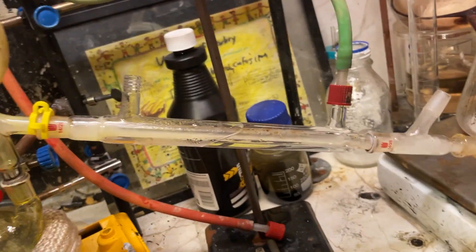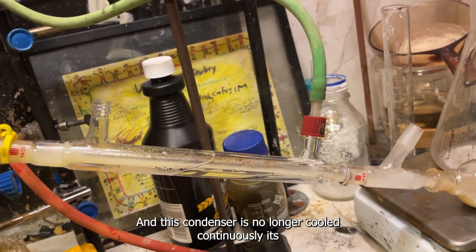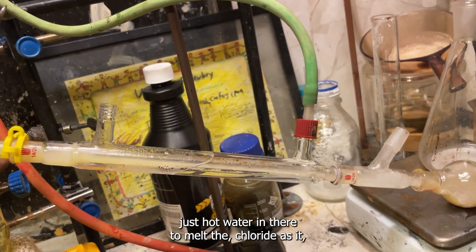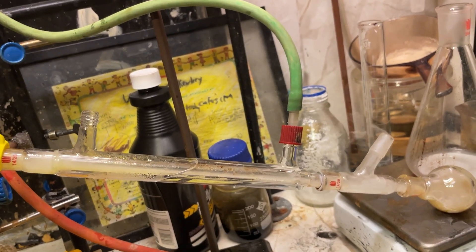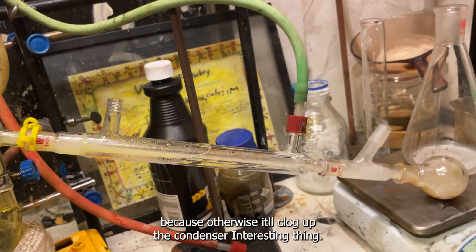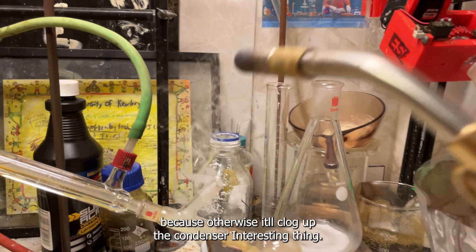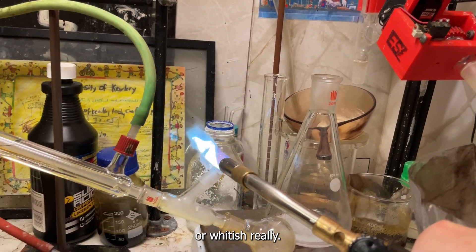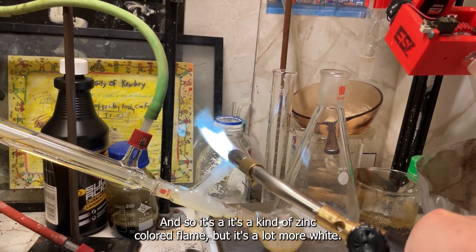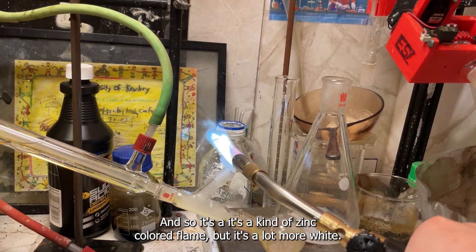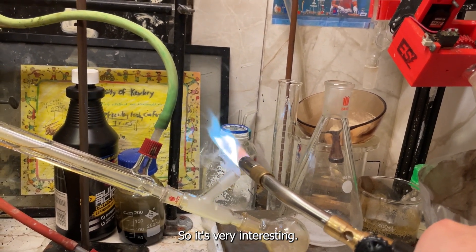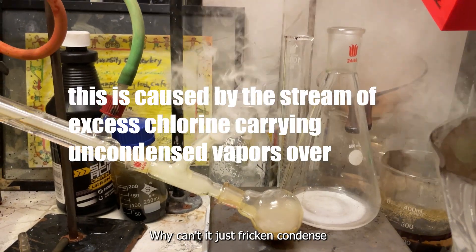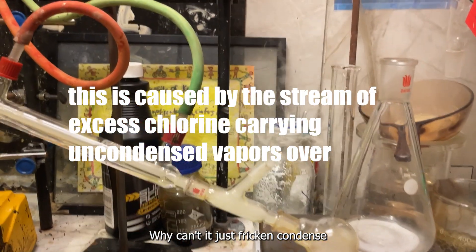And this condenser is no longer cooled continuously. It's just hot water in there to melt the chloride as it condenses, because otherwise it will clog up the condenser. Interesting thing. Antimony has bluish green smoke. Or whitish really. It's a kind of zinc colored flame, but it's a lot more white. So it's kind of interesting. Why can't it just freaking condense?